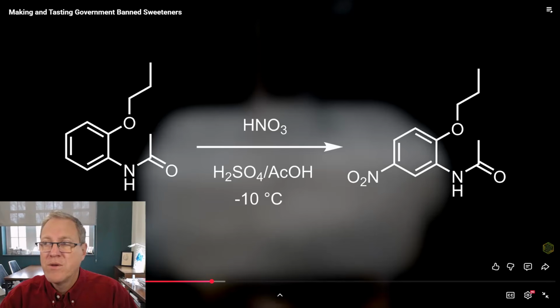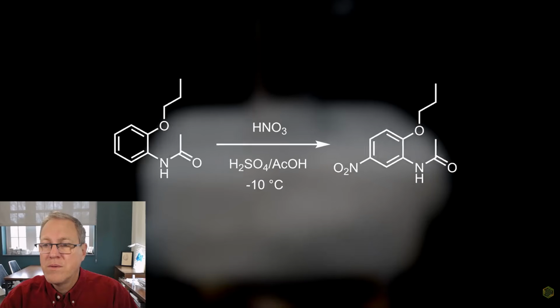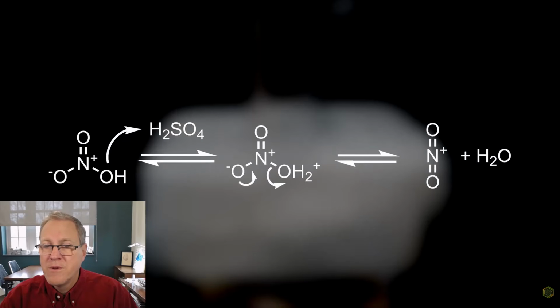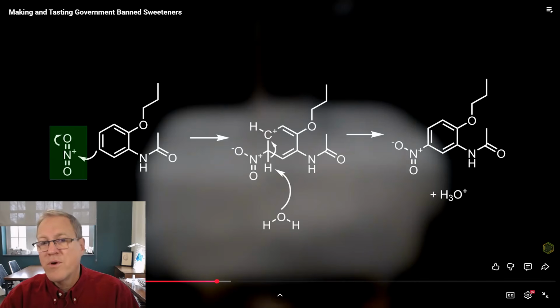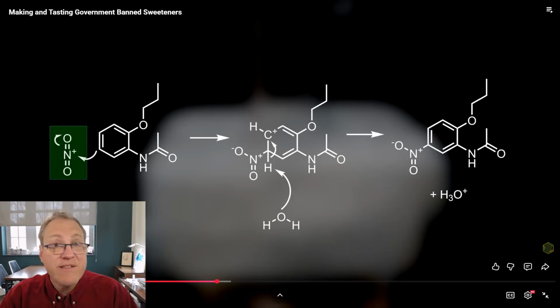It is especially helpful in dissolving acetanilides. For the rest, it doesn't play a role in this reaction. What first happened is a reaction between nitric and sulfuric acid. The nitric acid is protonated by other strong acids, such as sulfuric acid, and forms the nitronium ion and water. So that's the reactive electrophile. This is an electrophilic aromatic substitution. There's the electrophile in that green box, the nitronium ion, gets attacked by the ring.